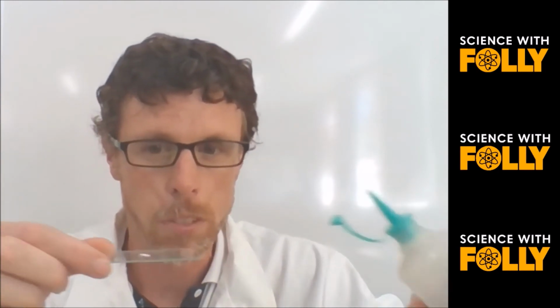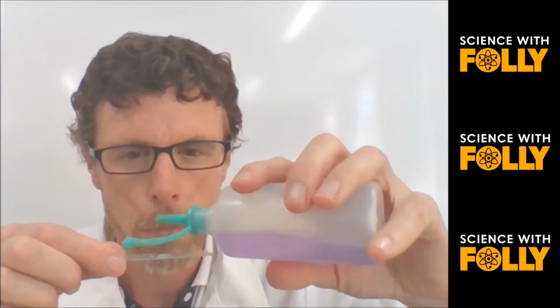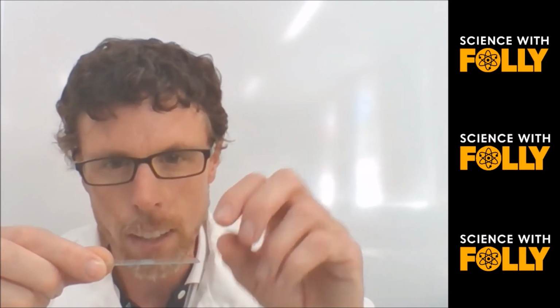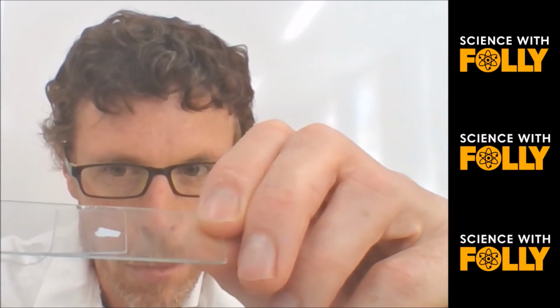When you prepare a microscope slide, you put your sample on the slide, then you put some water or some stain on top. Then you grab your cover slip on an angle, collect up some of that water or stain and drop it down. And as you can see, your slide's prepared.